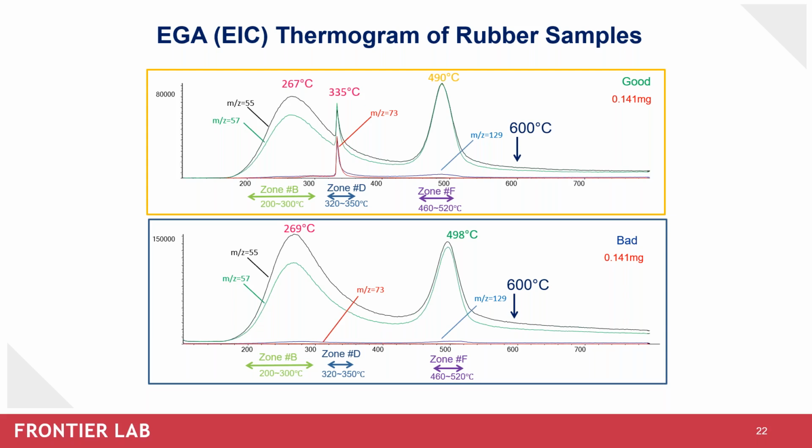So the time that is typically taken to heat a sample to about 600 C if you're using nitrogen and using the vertical microfurnace is about 100 milliseconds. Now, theoretically, by doing research, the time will be reduced to 1/7 in a helium atmosphere and is therefore comparable to the rate achieved when using a Curie point foil.